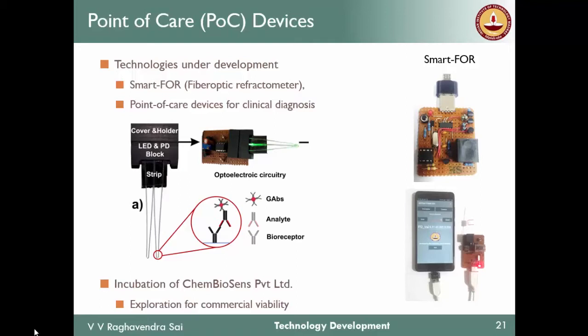Meanwhile, as an offshoot, we were able to get a crude digital fiber optic refractometer that can be interfaced with a smart mobile. So we hope we'll be able to commercialize this technology. Maybe.